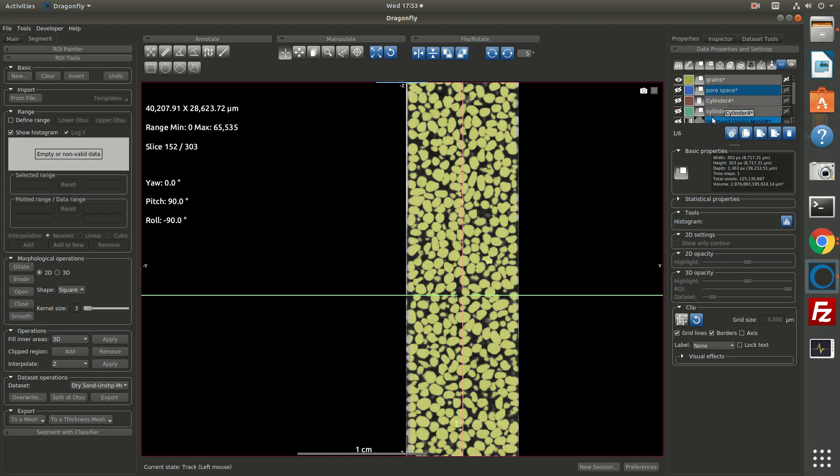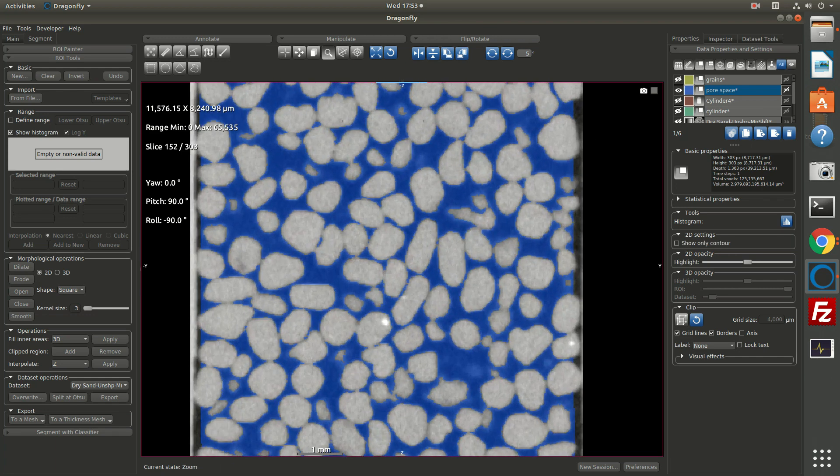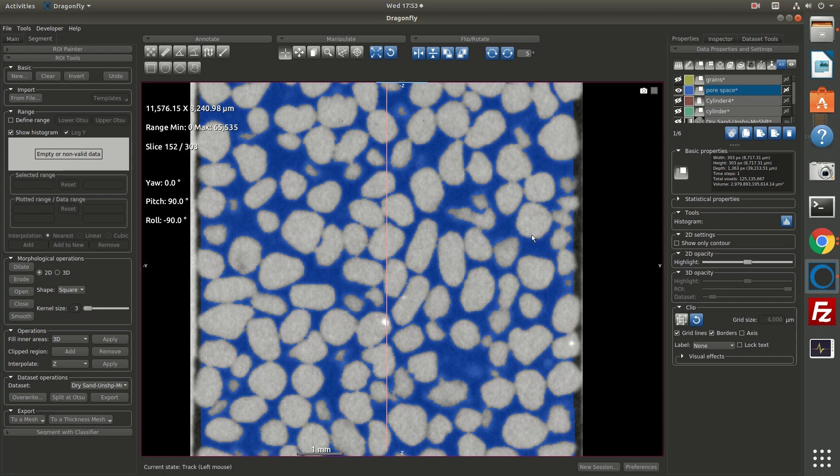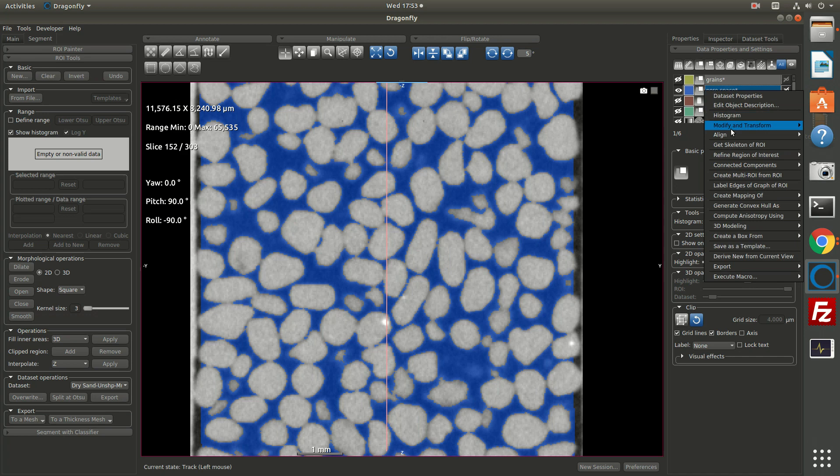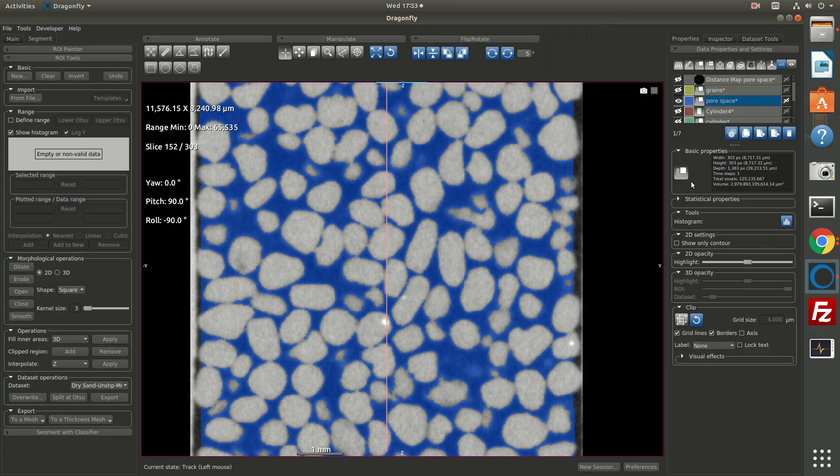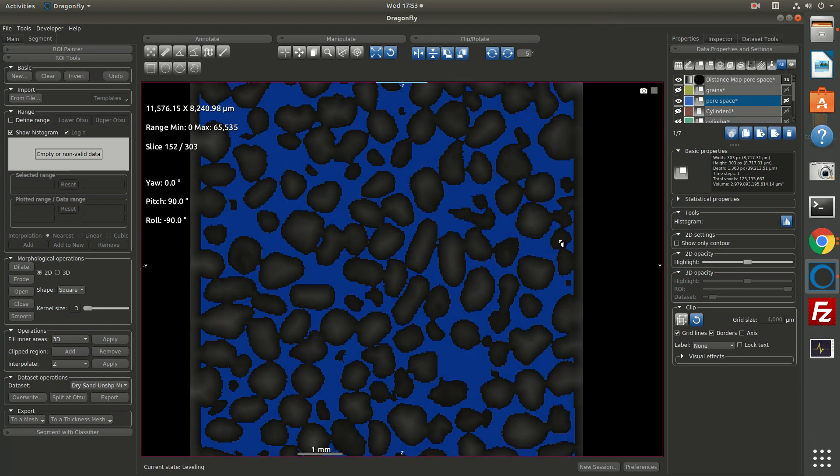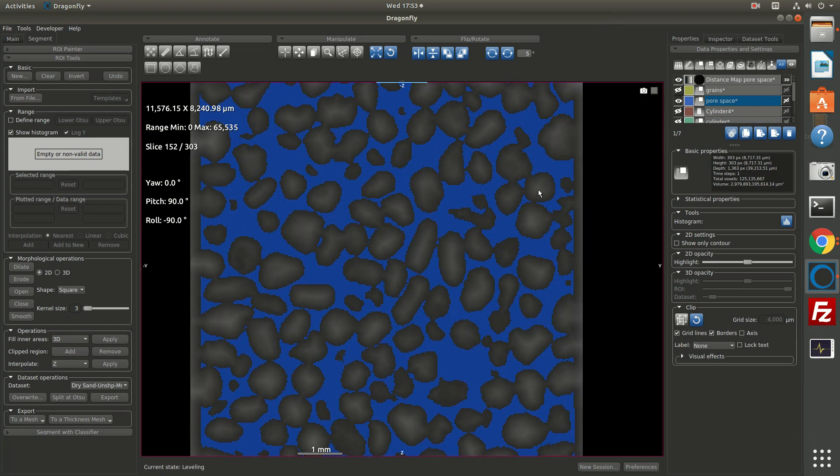Now what I'll do next is I would like to separate these grains. The first step in doing that is I'm going to use the pore space ROI and create a distance map. That is, I want a distance map of how far is every pixel from the pore space. I can right click on pore space and ask for create mapping of and choose a distance map. So this creates a distance map. And if we want to look at it, I can increase the brightness. So you can see we have a distance map.